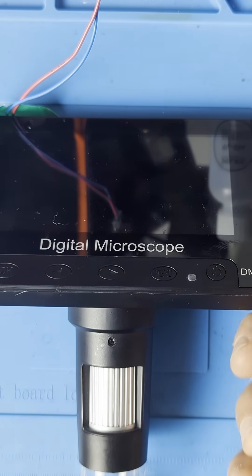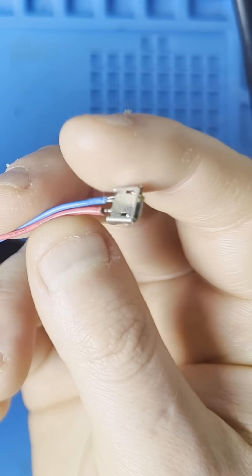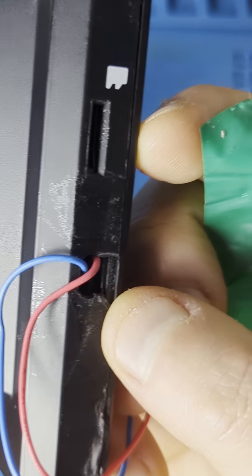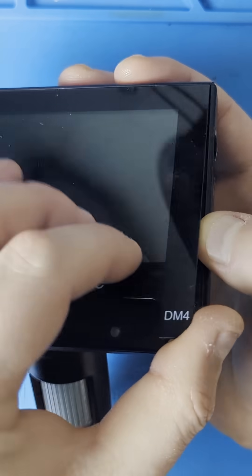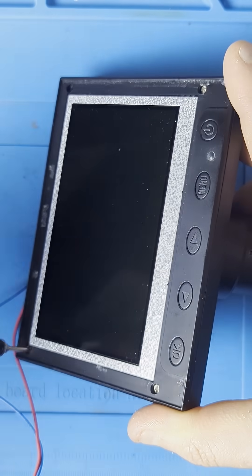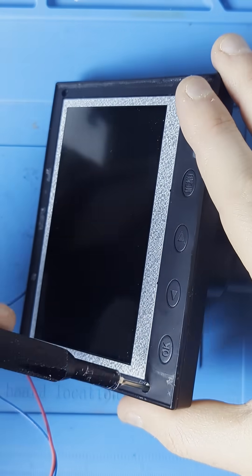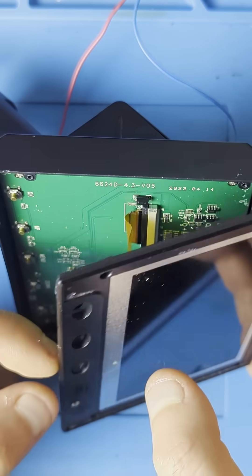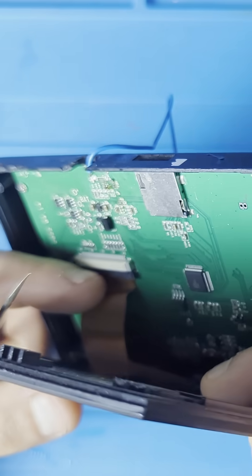So here we have the microscope, and as we can see here we have the micro USB port that goes into the spot where the micro USB is supposed to go. But this whole plastic assembly comes off. That should be free.